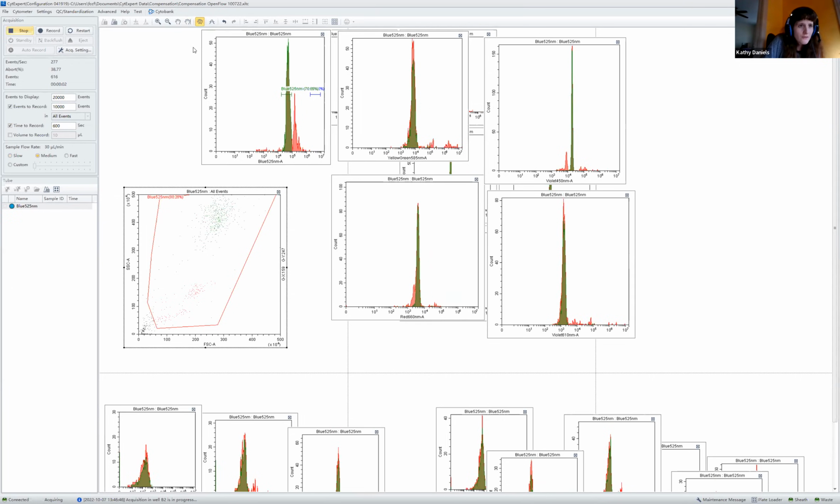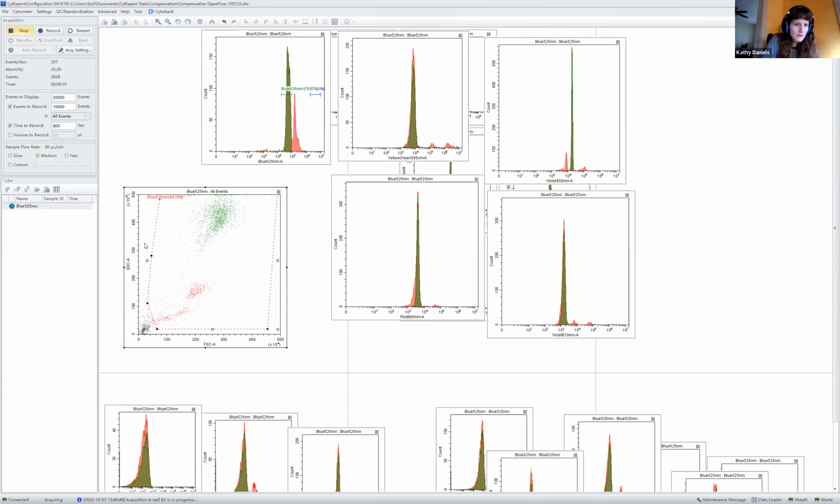And I think adjusting that flow rate actually helped a little bit, because now we're seeing it in addition to maybe that slight modification of gain. We're able to now see that right here once we changed over to the medium flow rate. Okay, perfect.